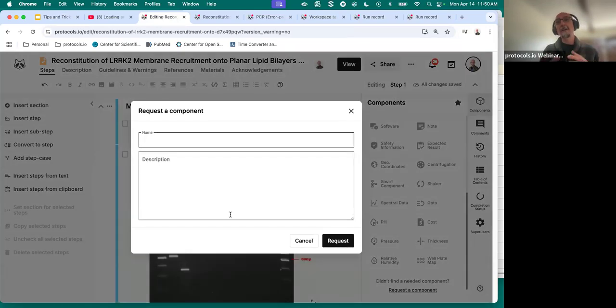So you can describe the component that you would like to see, and that request will go to our developers. There is no guarantee that the developers will definitely develop that component for you, but if we get that request repeatedly, we might develop such a component. Did I answer your question, Sebastian?